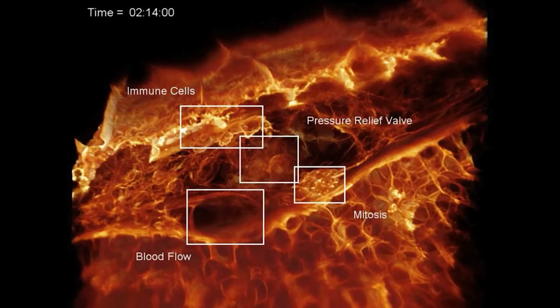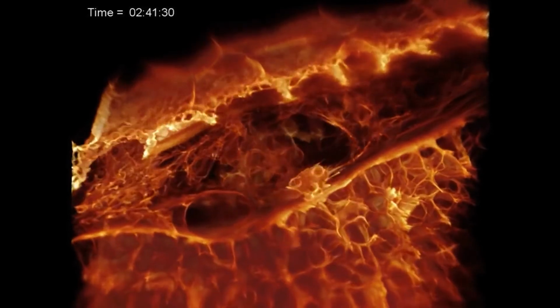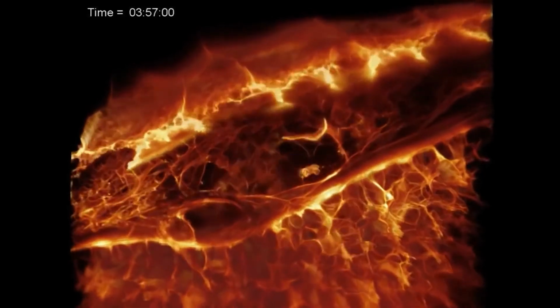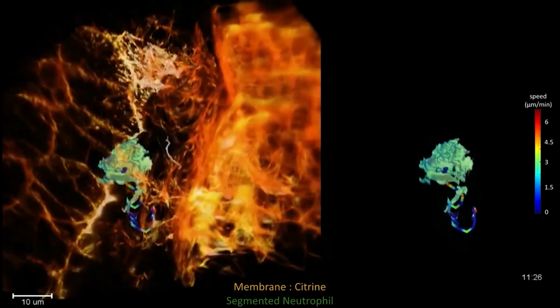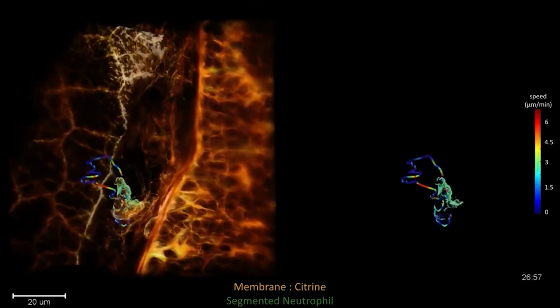In the video, you can see a white blood cell moving through the ear. Now, we've never seen that before because we can't image that live. But we can image it live here because we can see through the layers of this organism into the ear and watch it move around. We can track its centroid volume. In one of the images here, you can actually see cell reproduction going on in real time, stained. It's actually very, very good. And the images are so high quality.